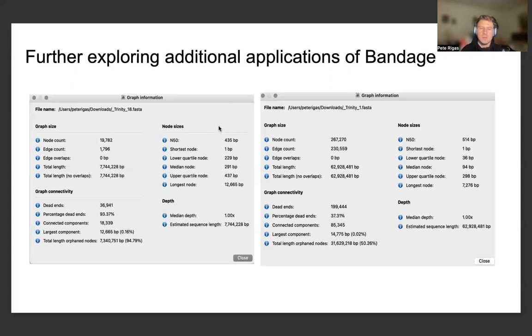We would like to see whether there are any interesting qualities of these graphs that can help us determine how probabilistic computation comes into play when we're running transcriptome assembly pipelines, because inherently in either transcriptome or genome assembly pipelines, there's some degree of uncertainty in how the algorithm can generate the total length of the sequence, as well as other smaller fine-grained components included in each one of the sequences.